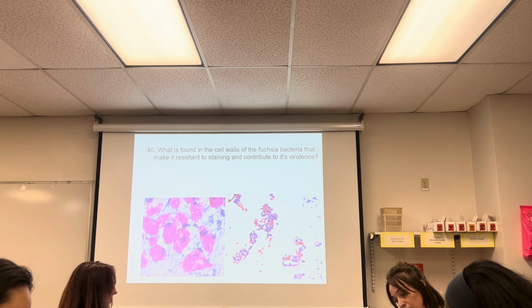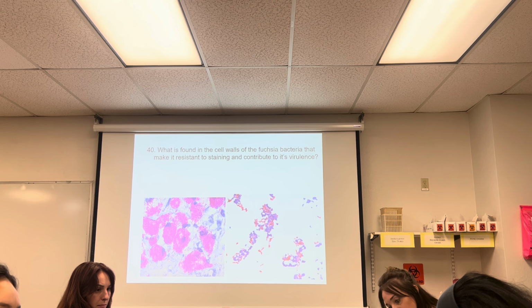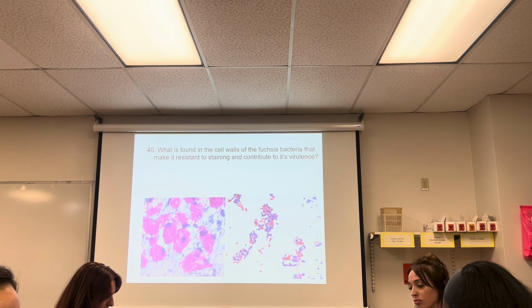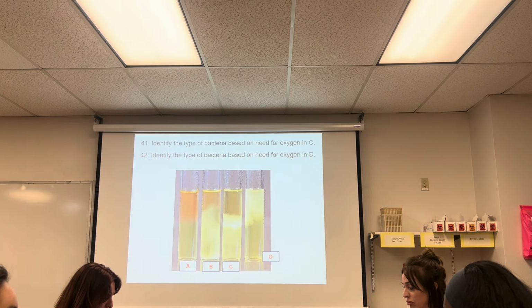There are only 2 staining techniques that use a decolorizer. The Gram stain uses what? Acetone alcohol. The acid fast stain uses what? Acid alcohol. Okay? All the others do not have decolorizers. This is thioglycolate. Now you have to think about it differently. This is pre-reduced medium. What does that red stuff mean?